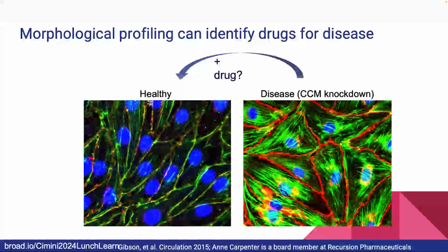And so what they did is exactly that. They took knockdown treated cells and they gave them drugs, and then they had a team of human experts pick what are the drugs that make the cells look the most healthy, and they had the computer using CellProfiler measurements do the same thing, and then they made 2 drug lists, human drugs and computer drugs, and they gave the drugs to mice. If you are a mouse, you totally want the computer drugs, because it turns out that even though we can tell the difference, we don't pick up the right kinds of differences.